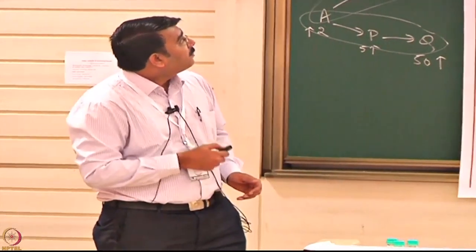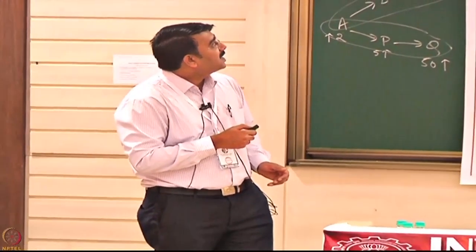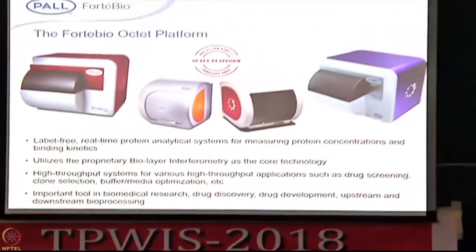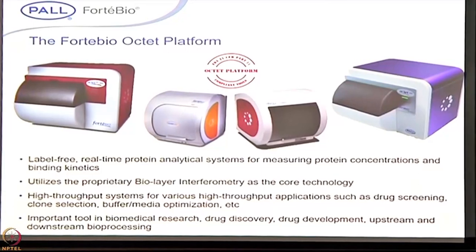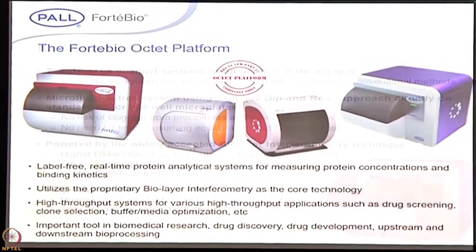So these are the platforms we have. This is the 16 channel instrument. This is the 2 channel instrument. This is the 8 channel instrument. And this is the 96 channel instrument. Depending upon the throughput required, you can choose the instrument.